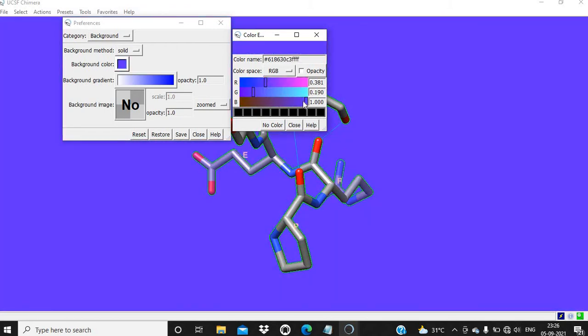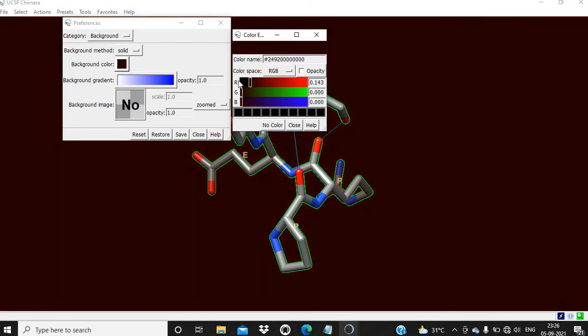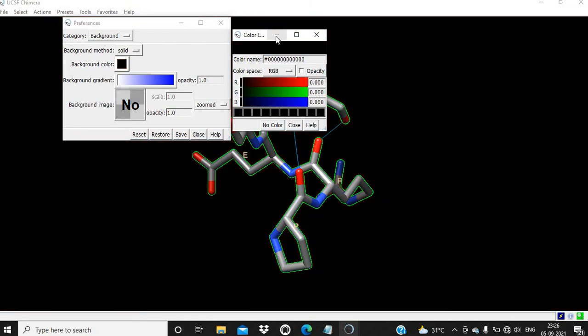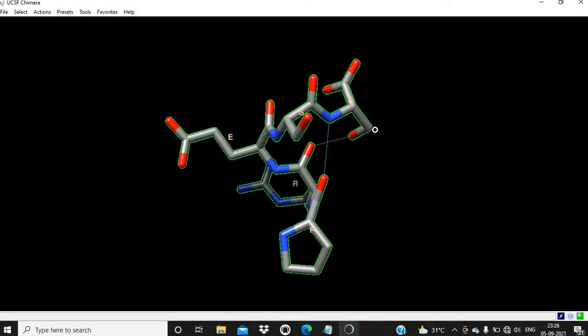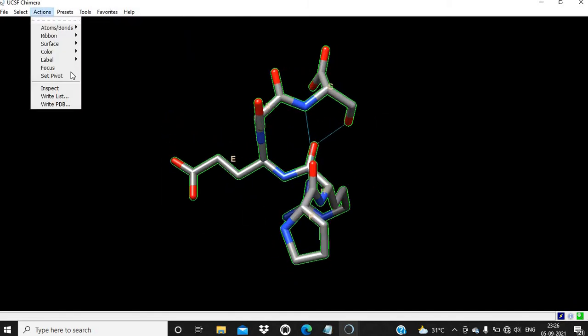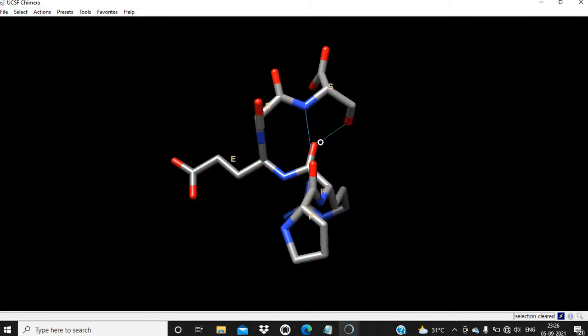If we change the background, then it will be visible. We are going to change the background. Now you can see the labels. Select, clear selection.